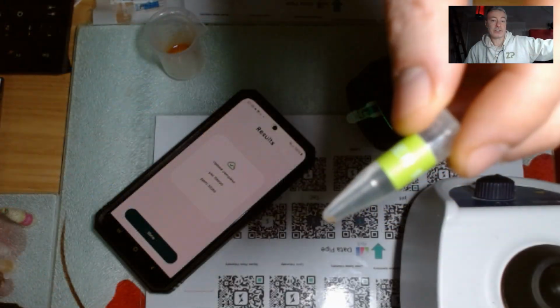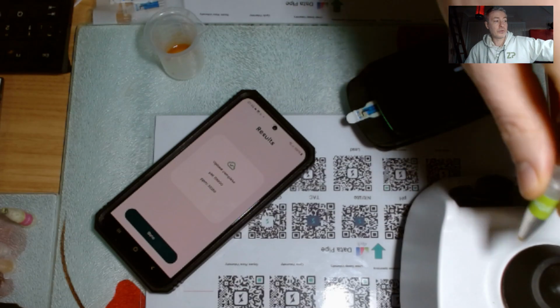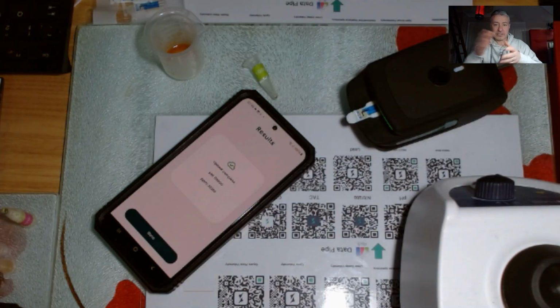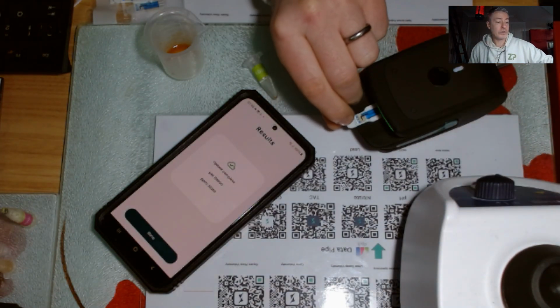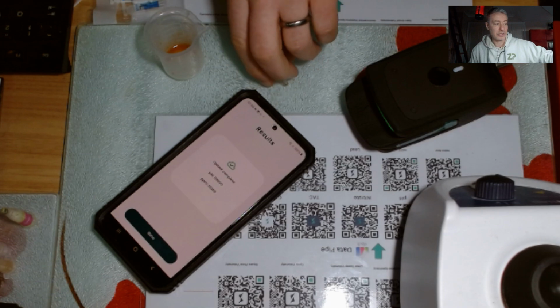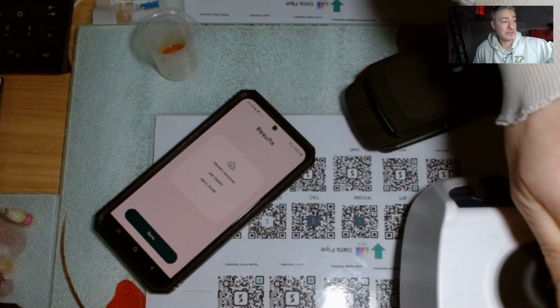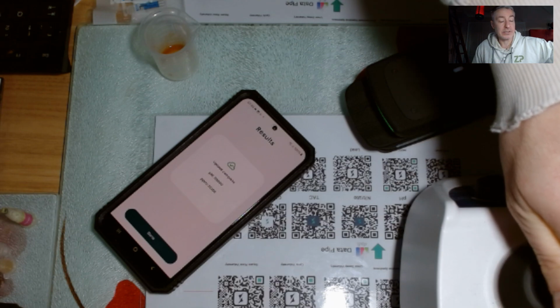You can just see the little bit of powder sitting at the bottom here now. It's very important to do a lot of vortexing. When you're doing these kinds of serial dilutions, you've got to vortex like crazy when you're taking those samples. Otherwise, you're going to end up not sampling correctly. If you're going to do a series of dilutions, when you're taking that sample to do the next dilution, it's got to be very homogeneous. And the vortex is a really good way of homogenizing things. So I'm vortexing just now anyway, because this is a 1 in 1000 sample.